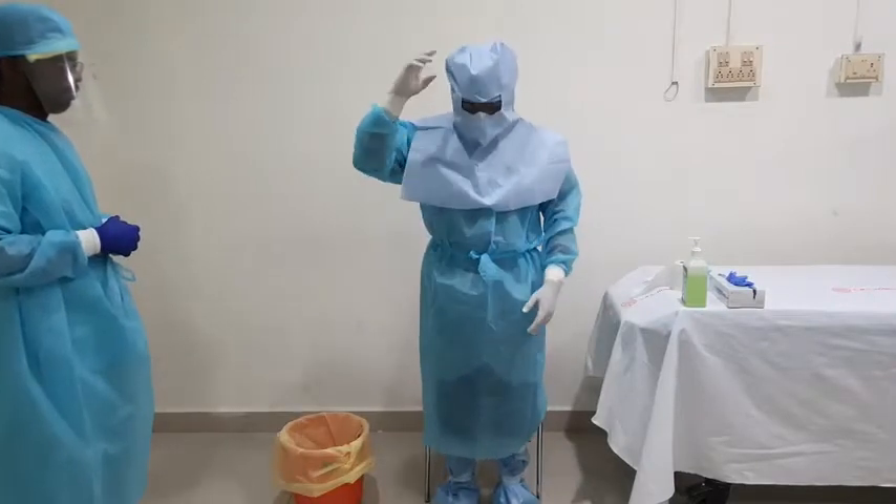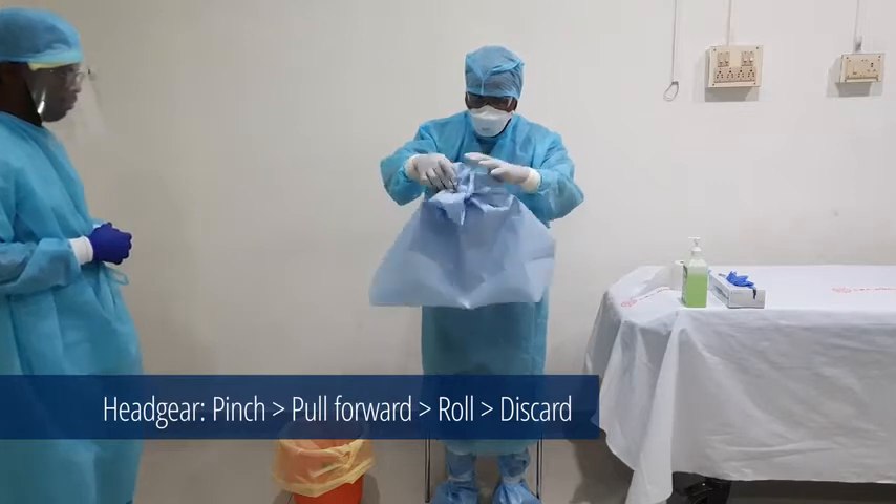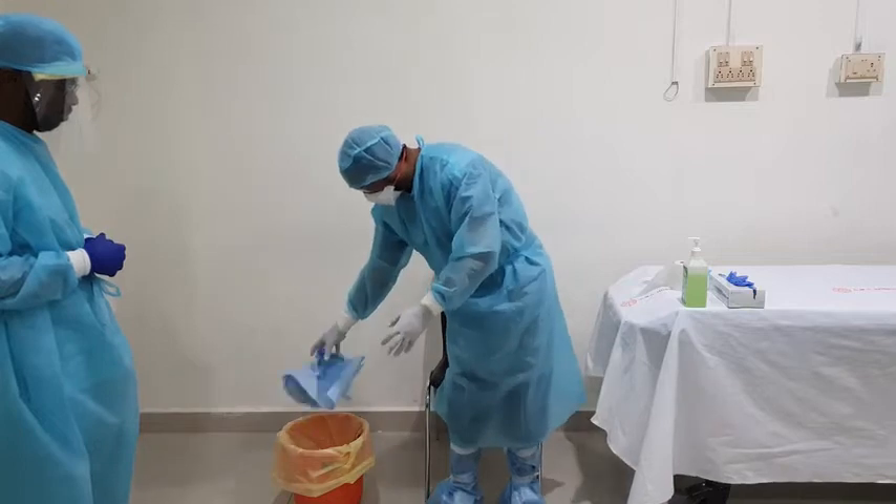Firstly, remove the visor or the headgear by tilting the head slightly forward and pulling the strap over the head, thereby allowing the face shield to fall forward. Discard it in the infectious waste container.